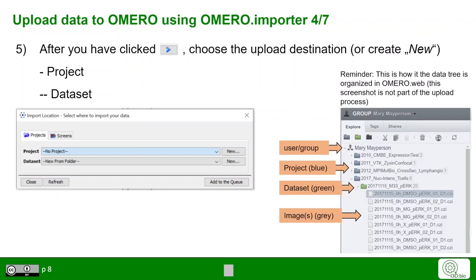As a reminder, this is how the data eventually looks in Omero. You have the project level represented by blue folder icons and the dataset level represented by green icons, whereas individual images in datasets are shown in grey icons.